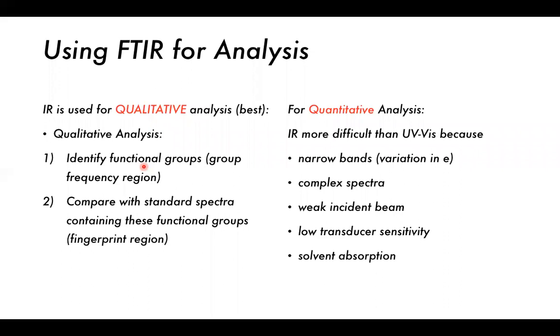the use of concentrations in solution and things like that. However, IR is more difficult to use than UV-Vis because of the narrow bands, which is due to the variation in the energy. We have a more complex spectra.